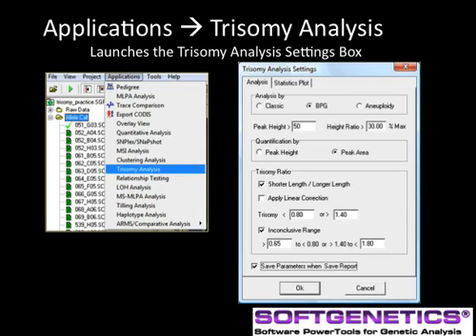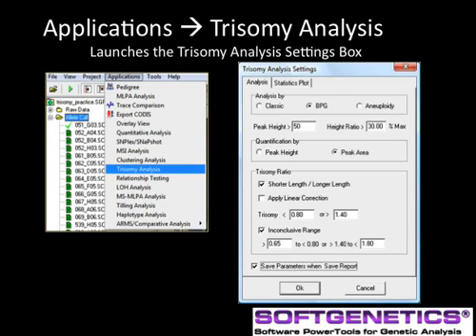The peak height and quantification options should be set per your lab's standard operating procedure. Values for trisomy and inconclusive range are in concordance with the best practice guidelines, but these may be customized per the lab SOP by typing in the desired range. Select shorter length over longer length from the trisomy ratio and deselect apply linear correction. Select inconclusive range — any peaks with ranges within the inconclusive range will be noted with a question mark in the final report table, indicating that further testing may be required.